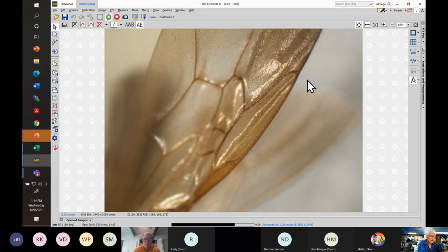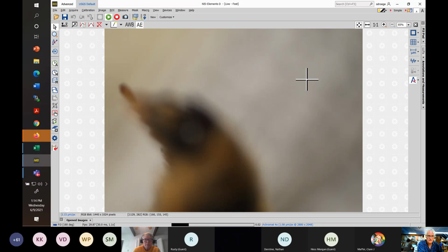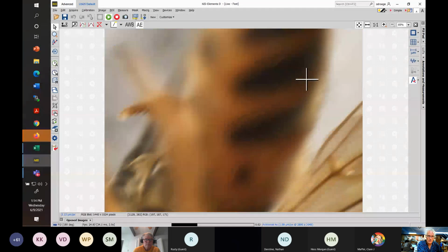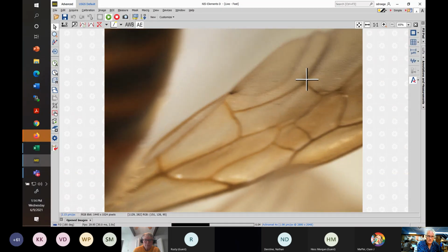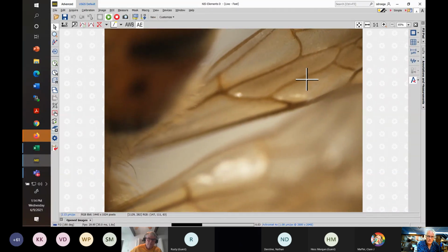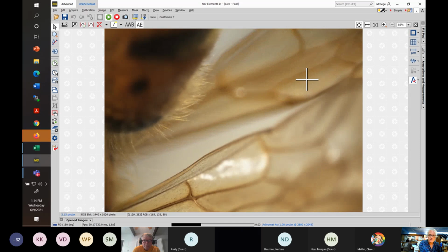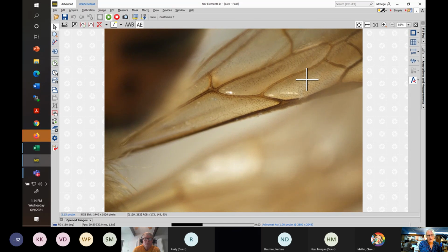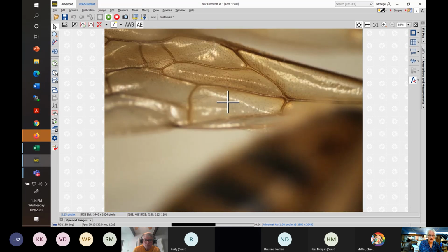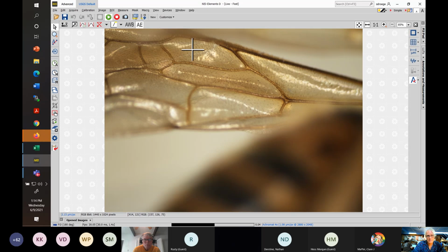We'll look now at, if I can get a good shot of it, the mysterious basal vein, which we can see, but is partially blocked by another wing cell here. That's a pretty good shot. Let me put it into focus. So this is better in terms of more classically. So you're upside down. So again, here's the wing edge. Let's turn it around. So I think that's a better reference point for people because that's usually how it's presented. Okay, now 3 submarginal cells. The stigma is folded back. You can't quite see it.